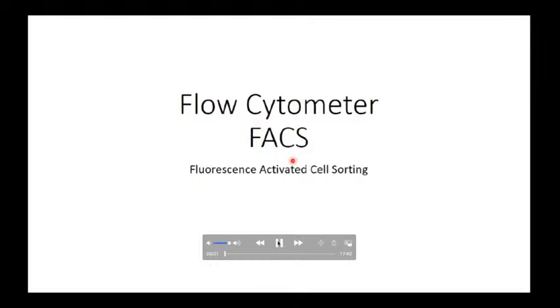Hello guys, this is a continuation of the subject flow cytometer and FACS mechanism. In the previous video, I spoke in detail about flow cytometer, and in this video, I'm going to speak about FACS mechanism, fluorescence activated cell sorting. If you didn't watch the previous video, I highly recommend you to go and watch it, because it will be much easier to understand FACS mechanism if you fully understand the flow cytometer mechanism. So let's start speaking about FACS.